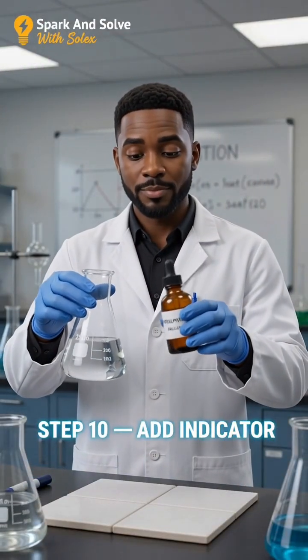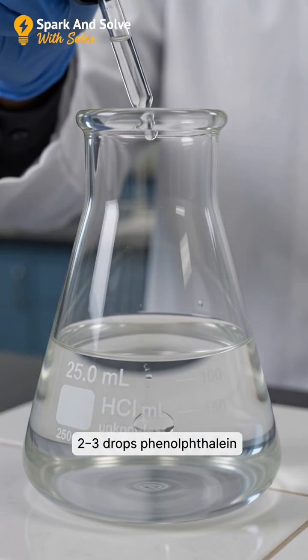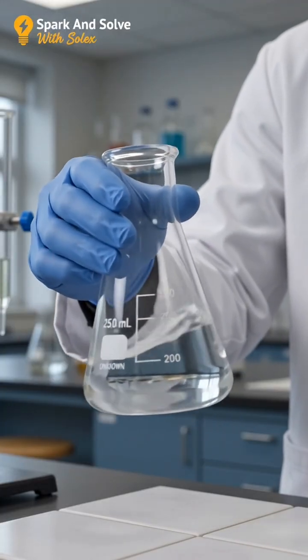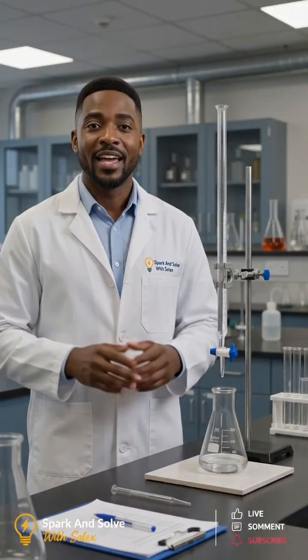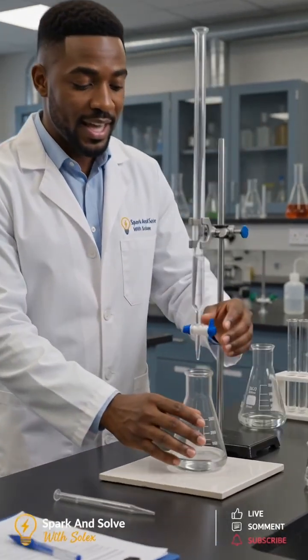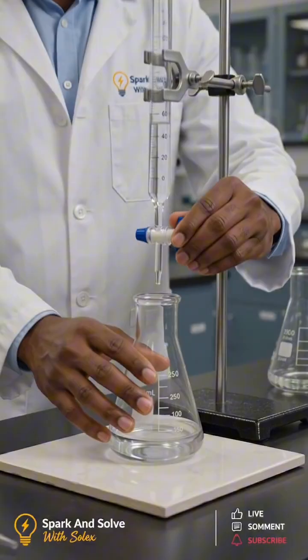Add 2 to 3 drops of phenolphthalein indicator and swirl gently. The acidic solution remains colorless. Everything is now ready. Place the flask under the burette and prepare to begin the titration.